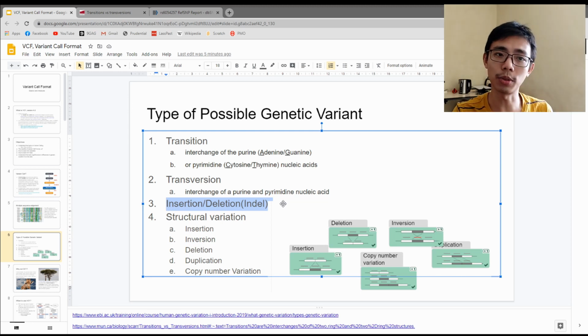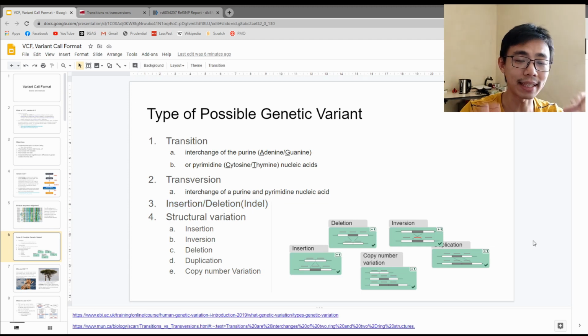So besides single nucleotide polymorphism and single nucleotide indels, there might be a code chunk that gets changed directly. So it is normal for, let's say, a transposable element to just jump from one part of the genome to another part. So there are 5 main types over here for this kind of code chunk mutation.